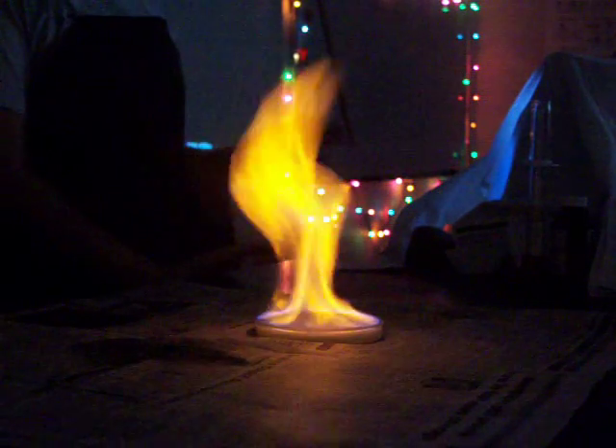We tried it with 3% and it was super dull. So we tried the 30% right after that — that was a little chaotic. So then we're going to try 6% and then 15% to see which one's better.